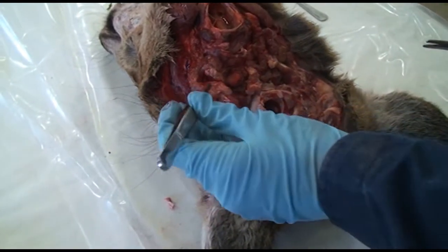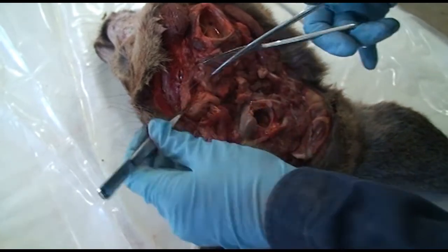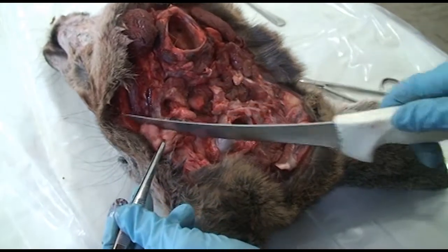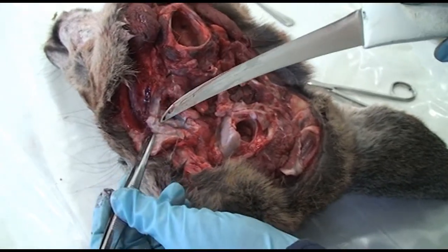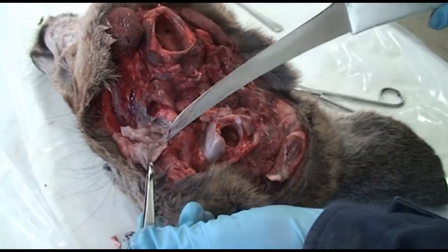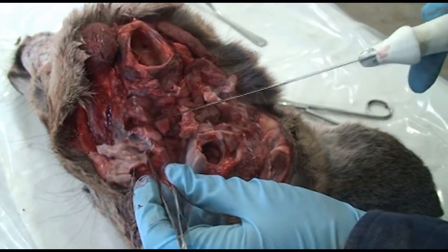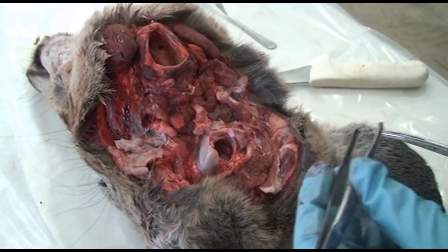So most of this tissue along the lateral side is salivary tissue. And you can tell the difference on the salivary gland. The salivary gland has a more cobblestone appearance to it, and if you cut it, it's cobbly, more like clusters of grapes. You can see the little clusters like that. It's not a homogeneous texture like the inside of the lymph node is. Sometimes you can see the capsule and the medulla with the lymph node, but that's the different salivary gland, and that sits on both sides, and the lymph node tucks up under next to that. So you've got to be careful not to get salivary gland when you're looking for lymph node.